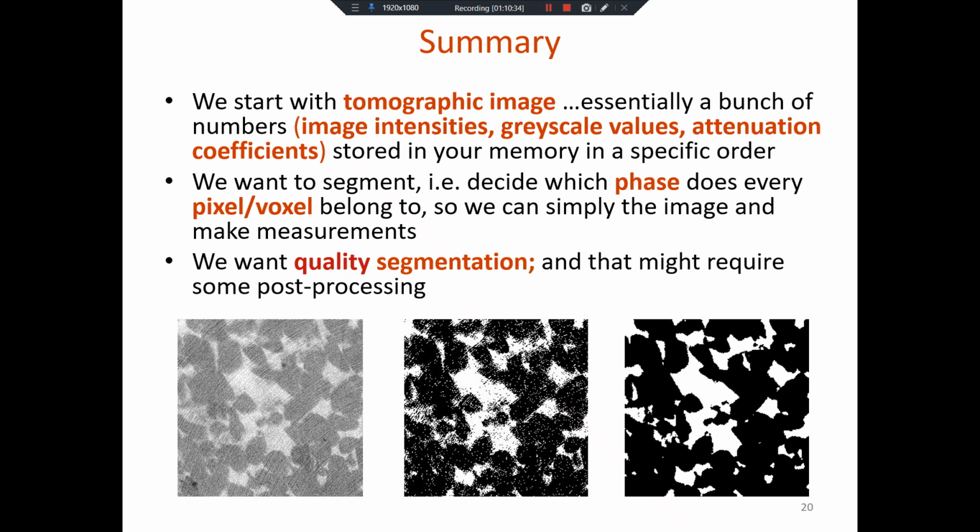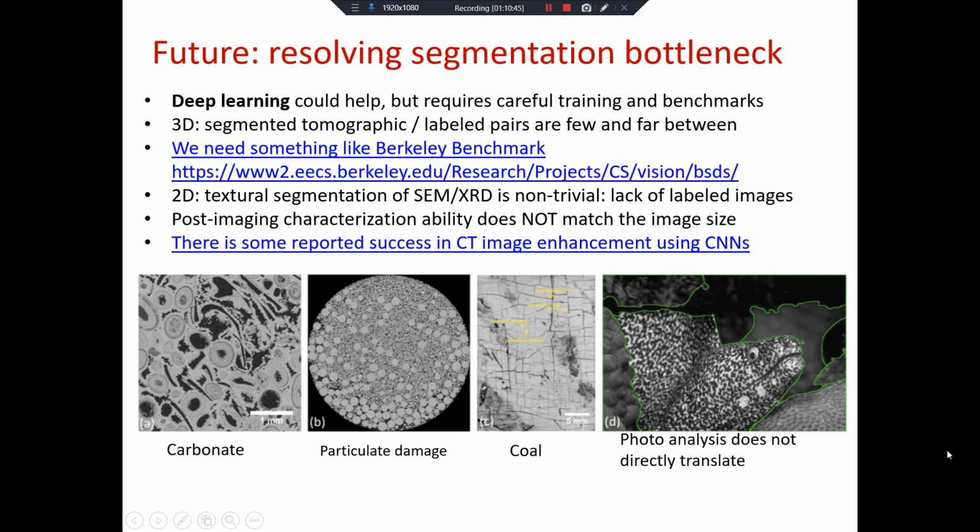The problem is, if I wanted to do a simulation on this, I can't. And ultimately we are not happy just evaluating porosity. We want to do more.